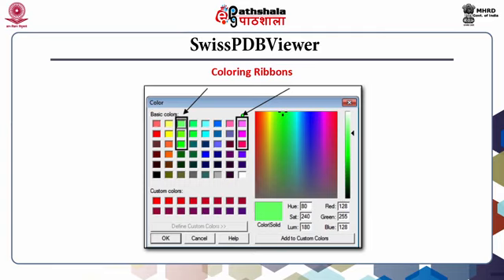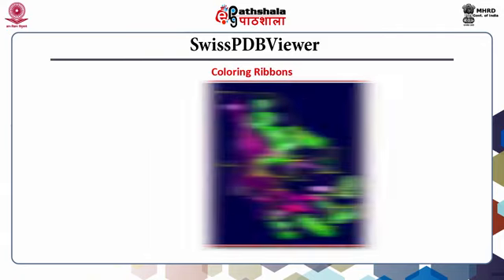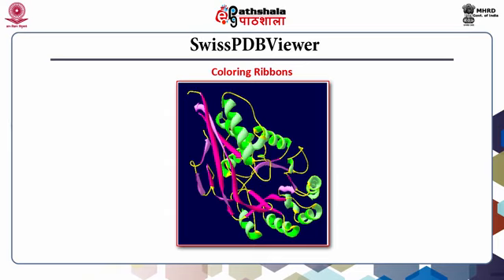After setting colors, the display of the enzyme OSBS will be shown in these colors. This coloring does not reveal a real 3D view but only a pseudo 3D view.